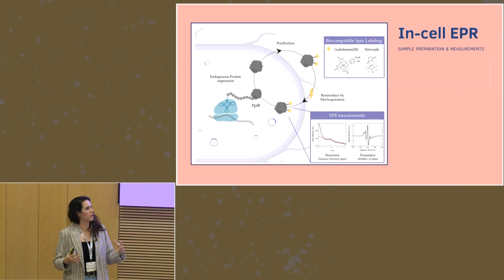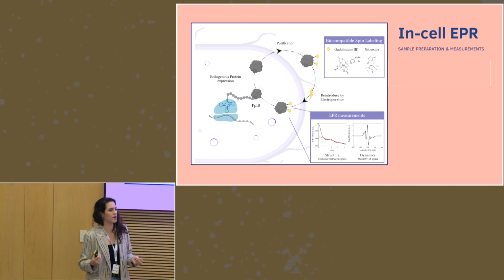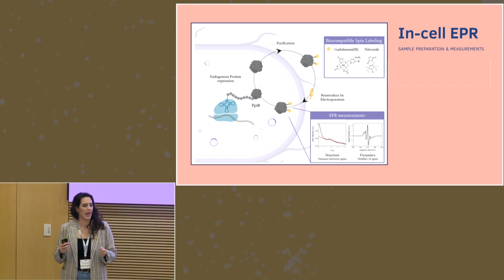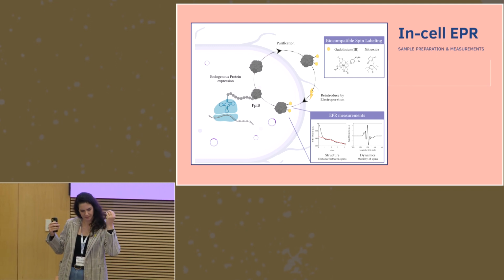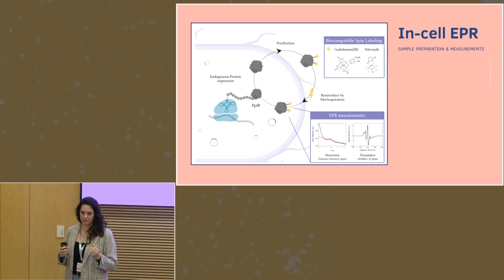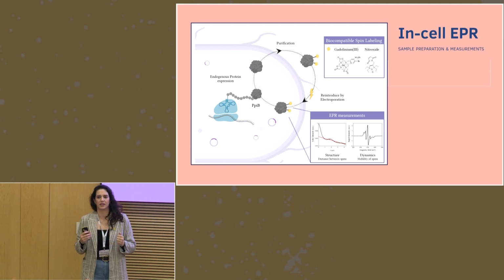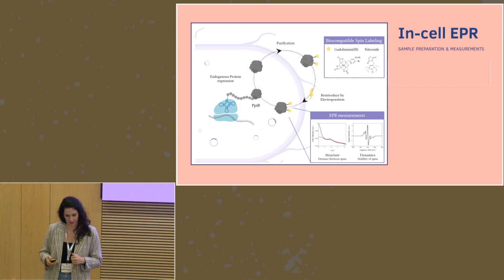And why is it so powerful compared to the other techniques? Because an inherent requirement of this technique is to spin label the protein, and then we can solely track the spin-labeled protein, which carries special probes that bear magnetic features, and we can track them upon a magnetic field among all the other cell components that are mostly diamagnetic, and therefore we are basically blind to them.